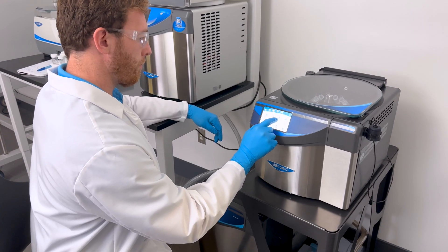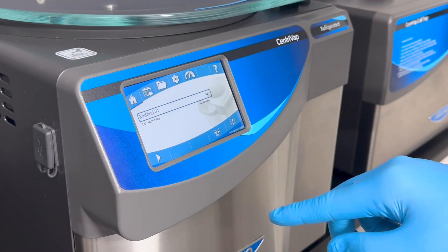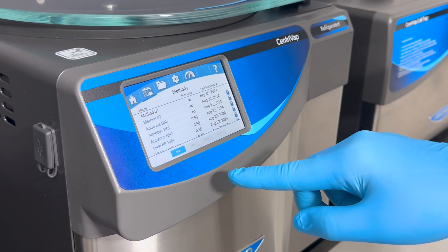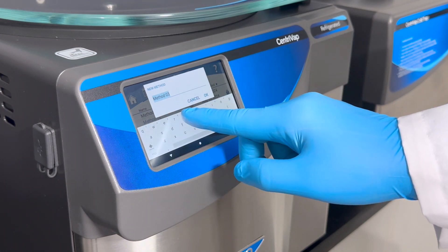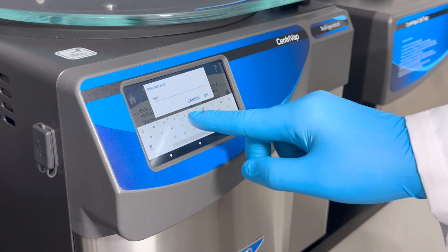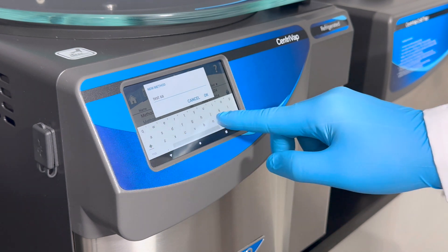The new intuitive 5-inch touchscreen control panel puts you in complete control of your Centrivap system. With VaporWorks OS, enjoy advanced data logging and output capabilities, programmable methods, in-run parameter manipulation, and onboard diagnostics, ensuring optimal performance and repeatable results.